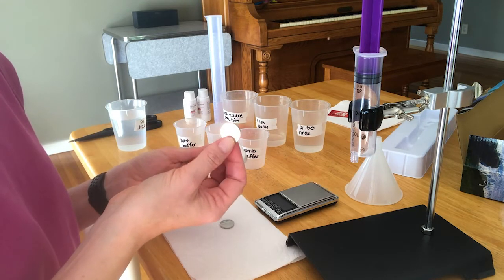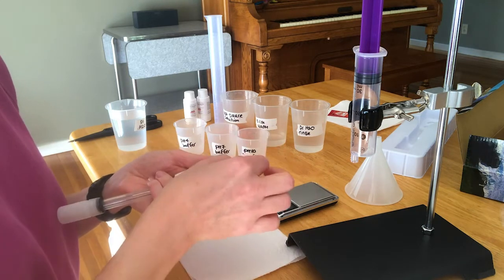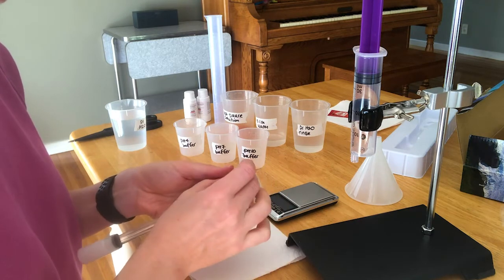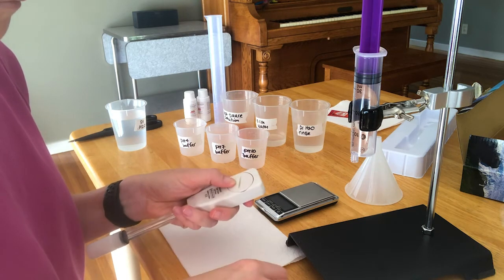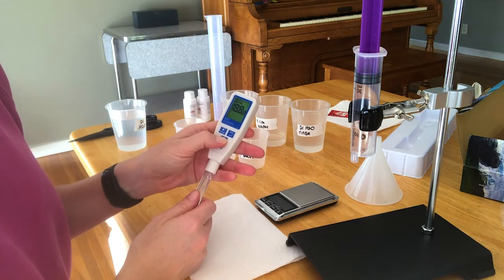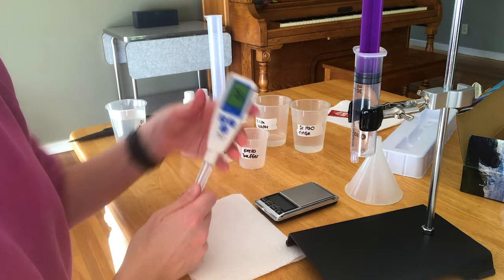You'll notice one side is flat and has a plus sign on it — that's going to go face up. Same thing with the other one. Then go ahead and twist it to the left to make sure that it's closed. Then you just have to press the start button or on.